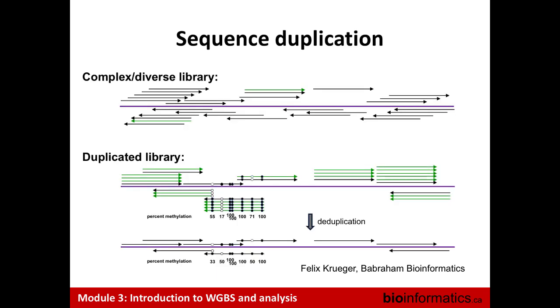So we talked a bit yesterday about duplication. Duplication in the context of methylation is going to be at some level even more important because we're going to be trying to quantify how many times we saw a methylated C. So this is an important slide.